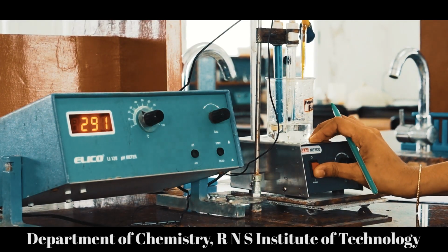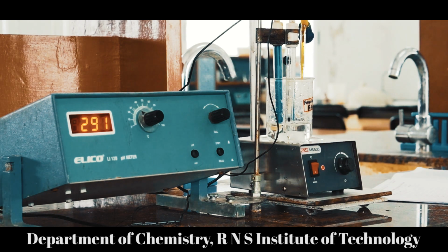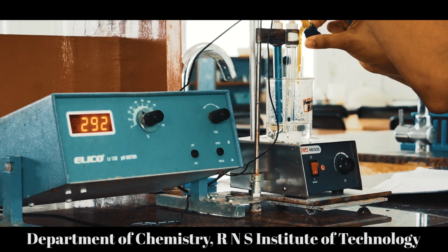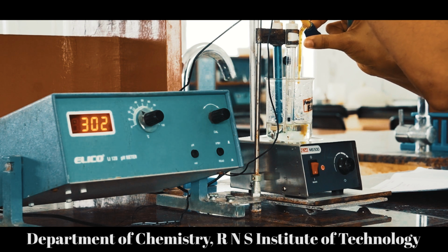Now, switch on the instrument. After writing the initial potential value, you need to add 0.5 ml of potassium dichromate solution from the burette. And for every 0.5 ml, you need to note down the change in the potential value.